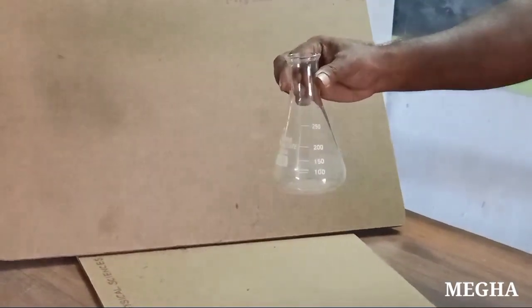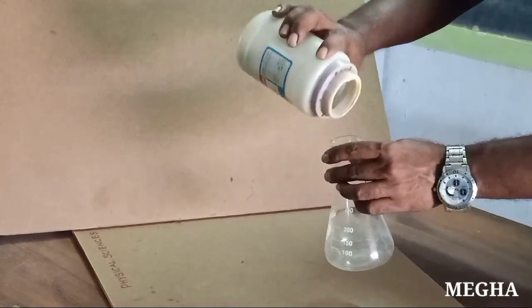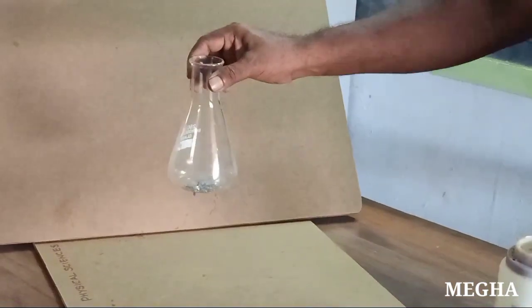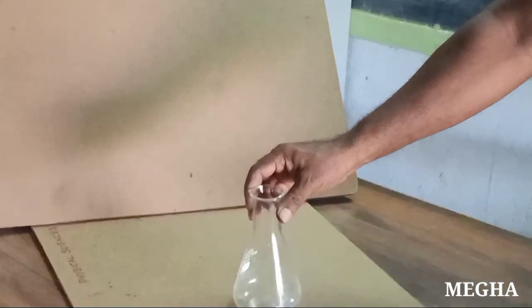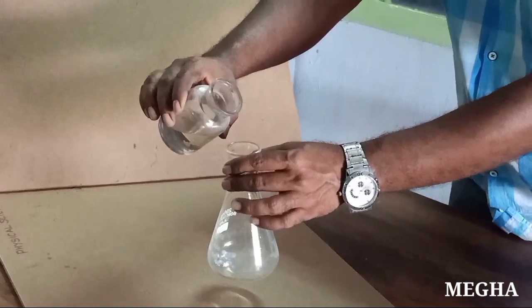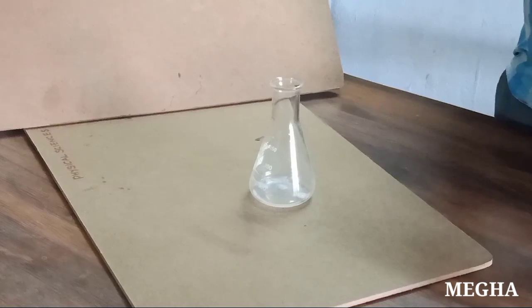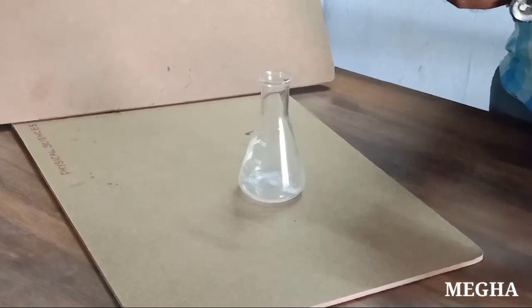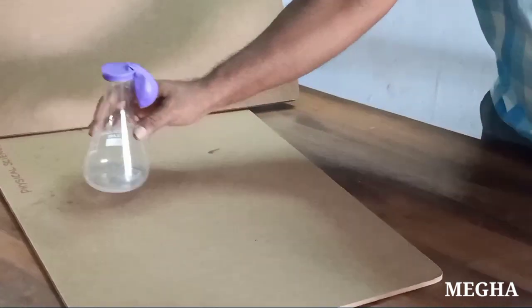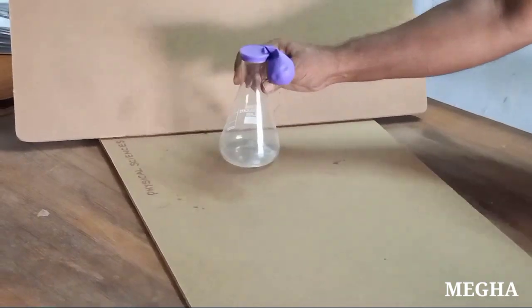Procedure: now take a conical flask, add some zinc granules in the conical flask. Add about 5 ml of dilute hydrochloric acid to the conical flask. Now take one balloon and fix it like this. Observe the changes in the conical flask.